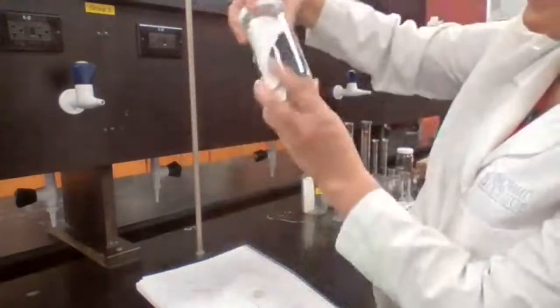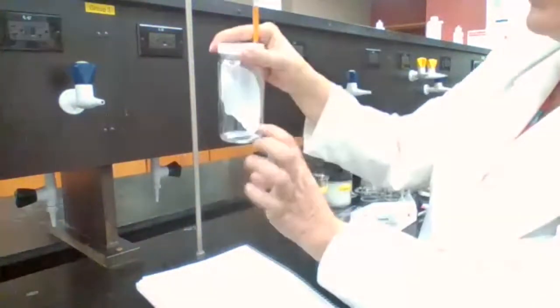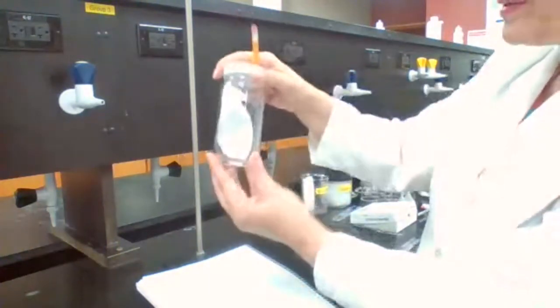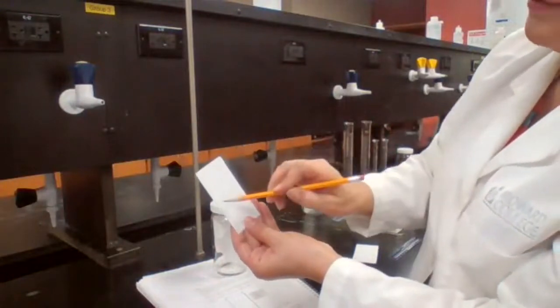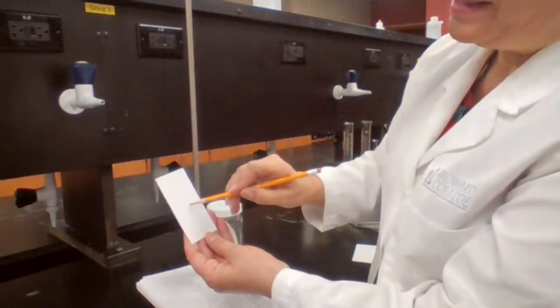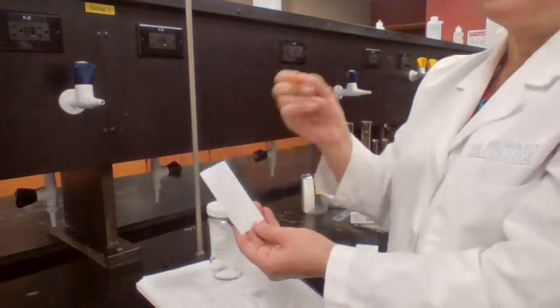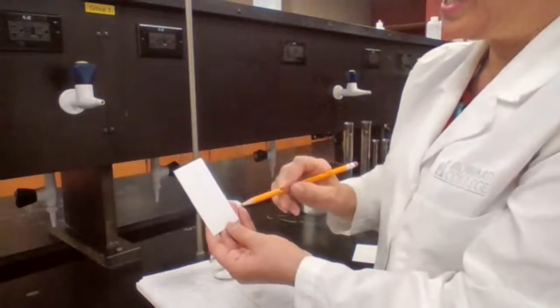The other thing I should avoid is, after I have my plate inside the developing chamber, I cannot lift it up and look at it, because I'm going to create waves in the solution, and the solvent is going to move up with waves. If I create waves by moving the developing chamber often, then the distance traveled for all samples is not going to be the same, so the RF values that I'm calculating are not going to be accurate.